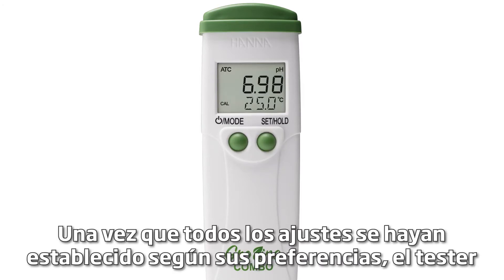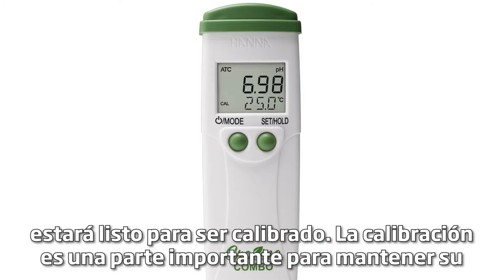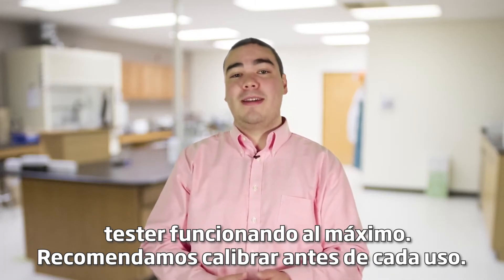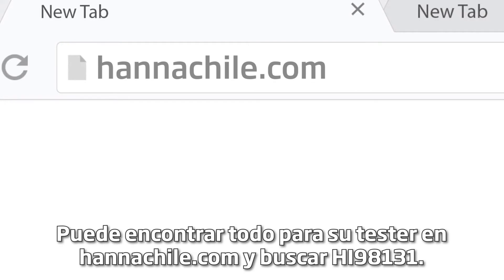Once all your settings have been set to your preference, the tester is now ready to be calibrated. Calibration is an important part of keeping your tester operating at its best. We recommend calibrating before each use. You can find everything for your tester at hannainst.com/HI98131.